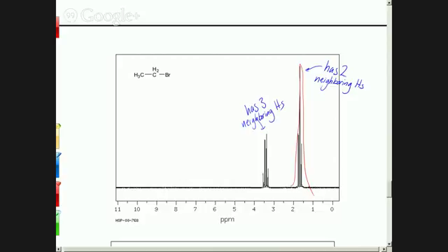And then what we're not told on this particular spectrum is the integration. So how many are actually in there? What we would expect to see if we integrated this, like we did with your spectrum, is that little integration symbol. I'll use a different color so we don't get lost here. The green never seems to show up that well. So this one would say 2.00, and this one would say 3.00, or something around there. They're not always even numbers experimentally. You round up or you round down, depending on what makes sense. Yeah, it probably rounds up to 3. It depends, because it's an arbitrary thing, because we picked where to start and stop there. So we're not always picking in the exact right place or in the exact same place, and that's what gives it that variation.